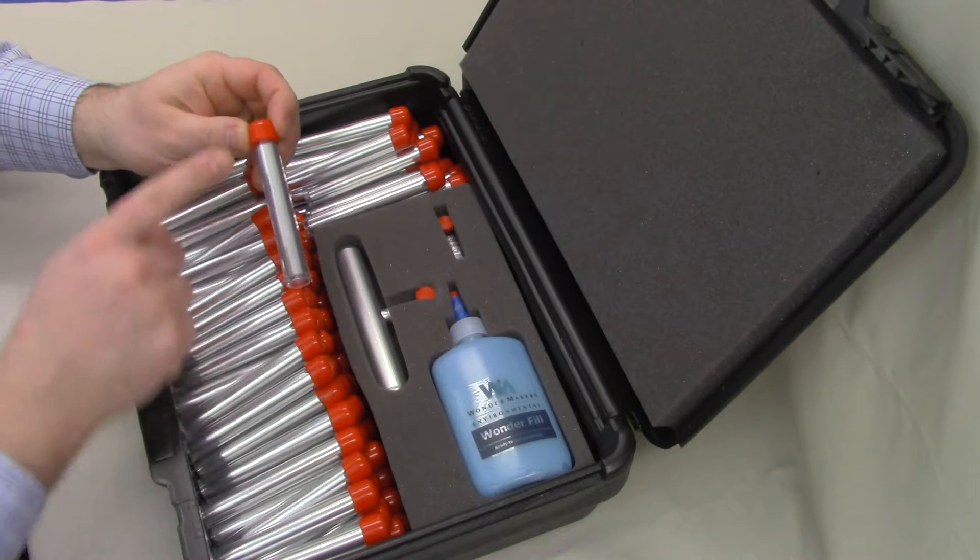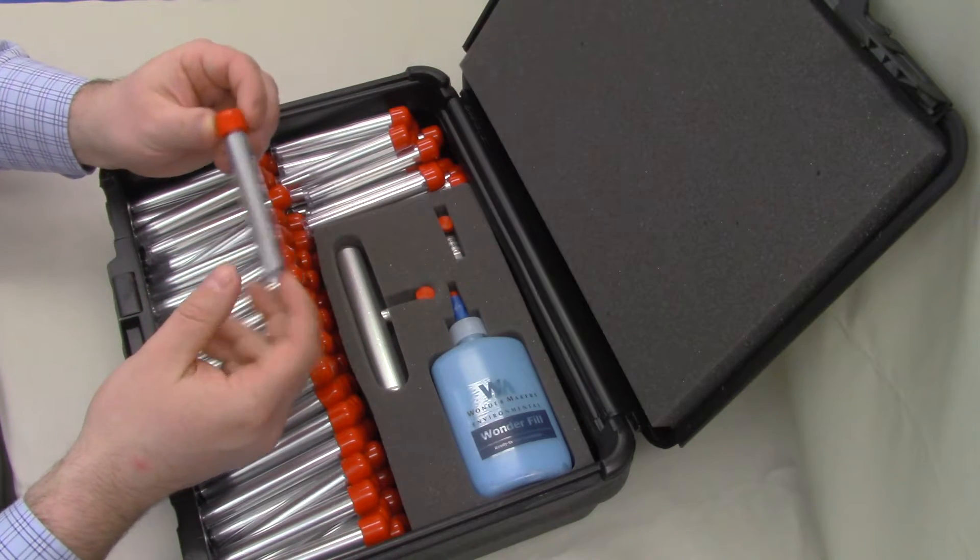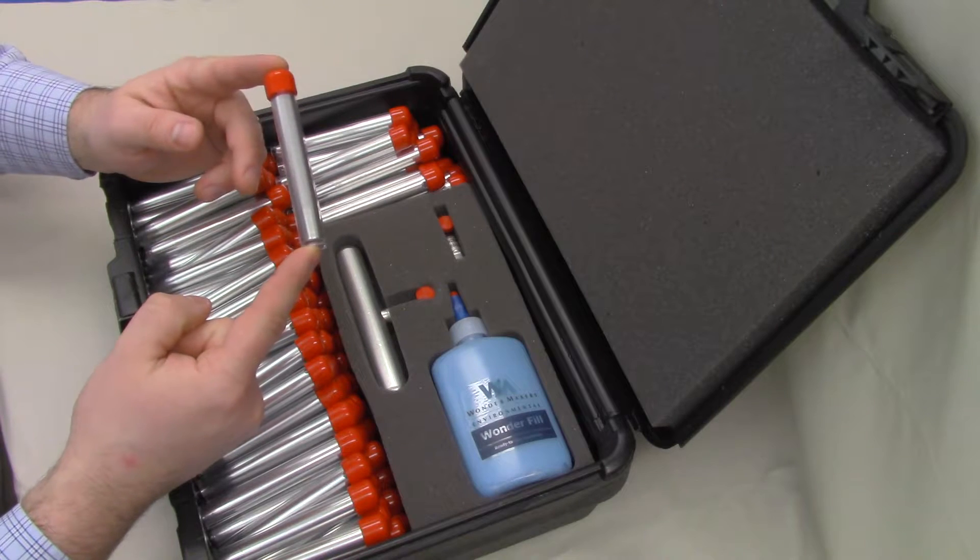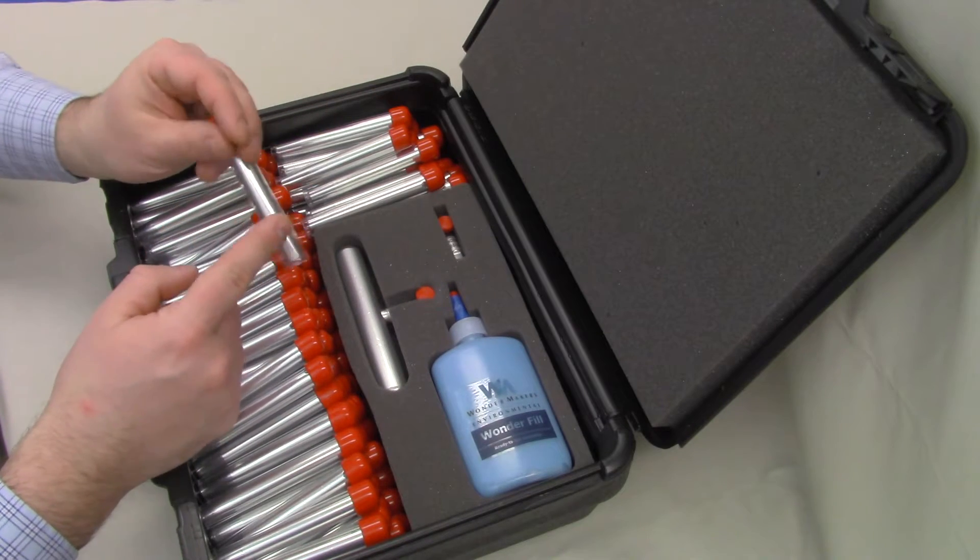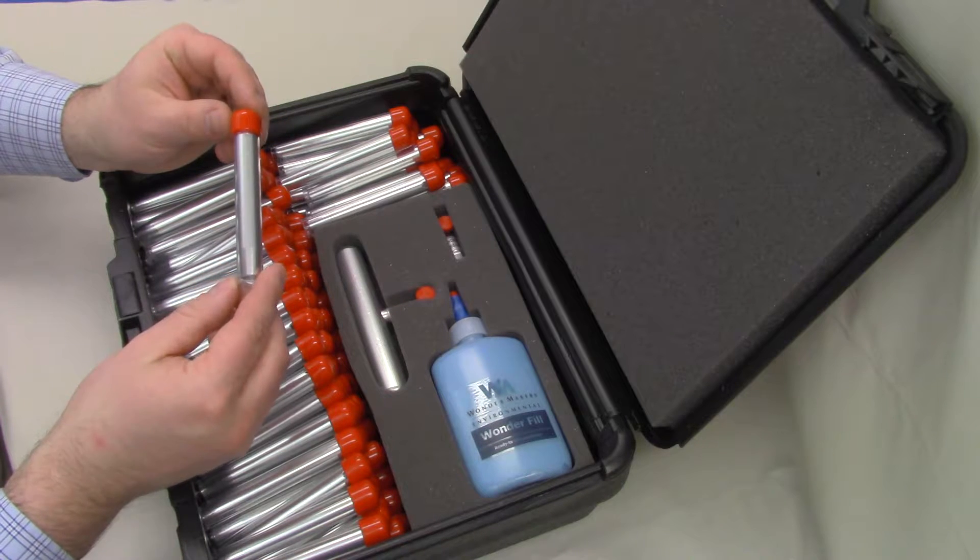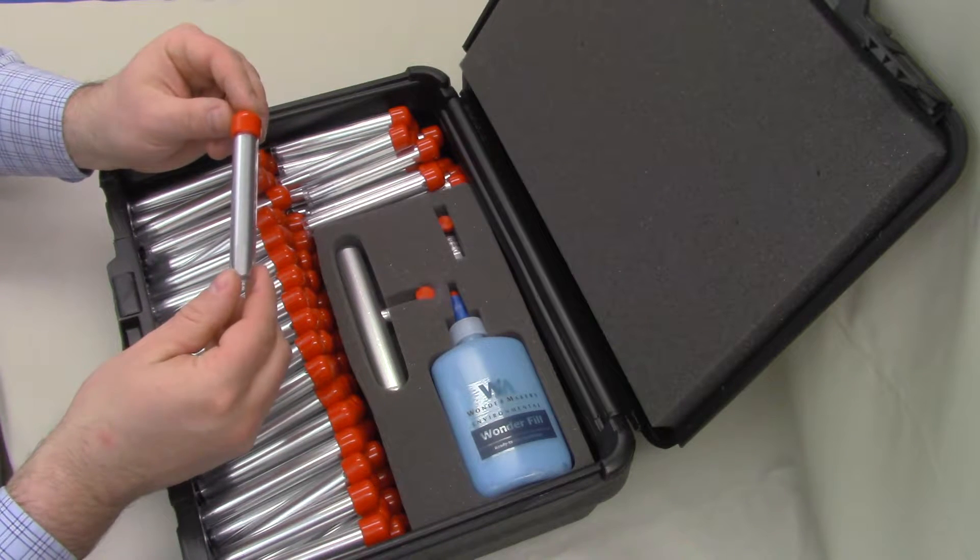So the cutter sleeve is an aluminum piece that's packaged in a hard plastic vial with a rubberized cap. This creates an airtight sample system. So once your sample's been collected, it's in here, no asbestos fibers or other dust from your sample material is going to leak out into the environment.